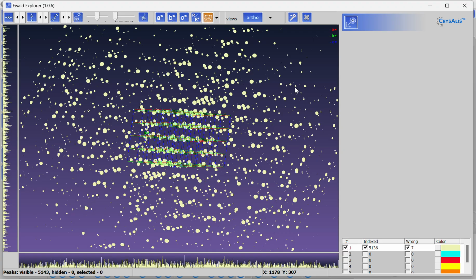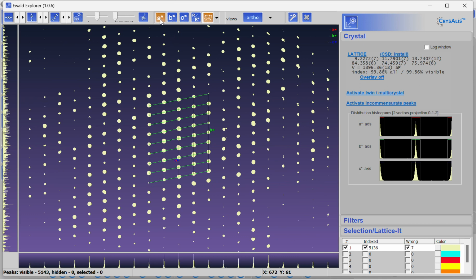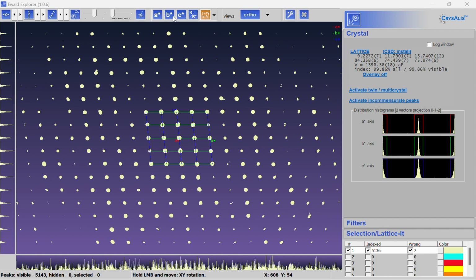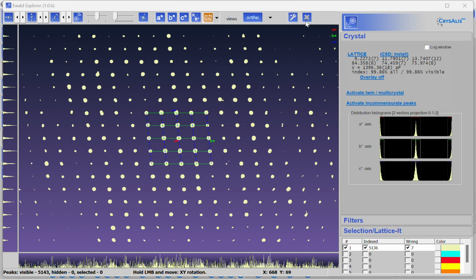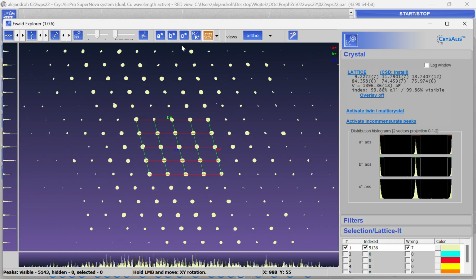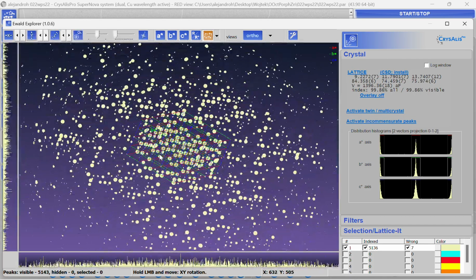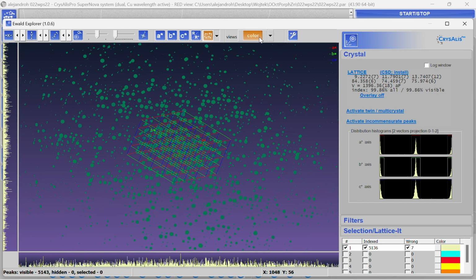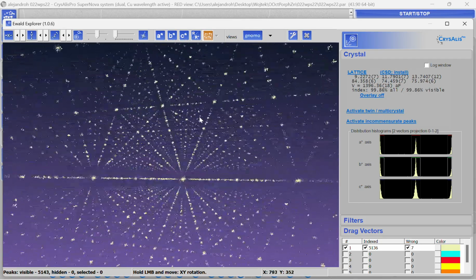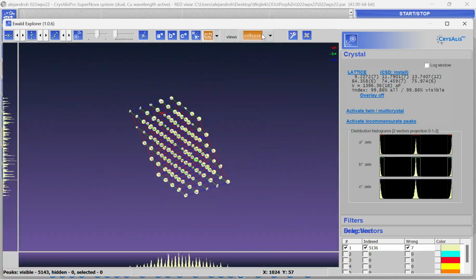Okay. So a useful thing is to go to Lattice Wizard. We can open Ewald Explorer to look at the Ewald sphere. By clicking here, we can look at the Ewald sphere at different projections, at different orientations. For some reason I have problems clicking here, probably because the movie recording software has an icon somewhere there, but oh, now it should work. Yeah, and we can also rotate it like this. If you want to do something fancy, you can look at it from a bit different views, but it's not that useful, but definitely looks kinda fancy.